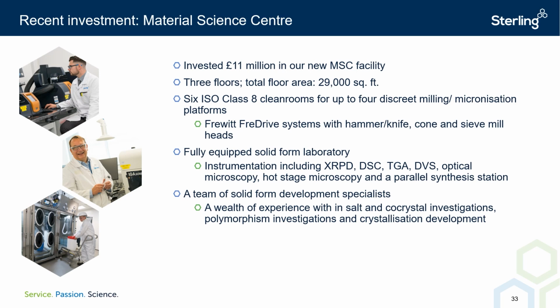An understanding of the polymorphic behavior of the API is necessary for formulation development, drug product manufacture, and intellectual property, but also API isolation, the final step of API synthesis. Any process that features a crystallization and isolation may benefit from crystallization development in order to maximize recovery, improve impurity control at key steps, or even improve process throughput via more efficient filtration and drying operations.